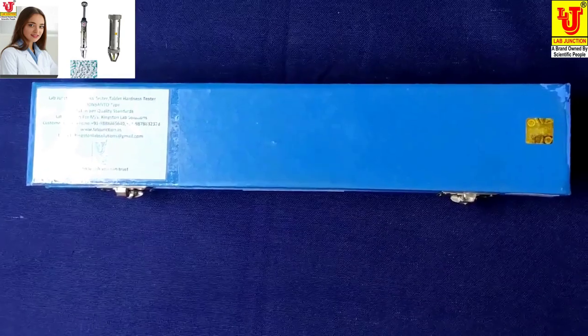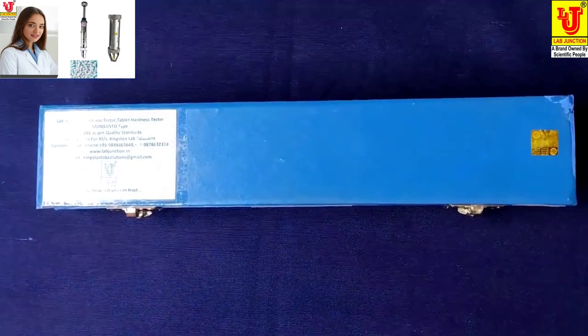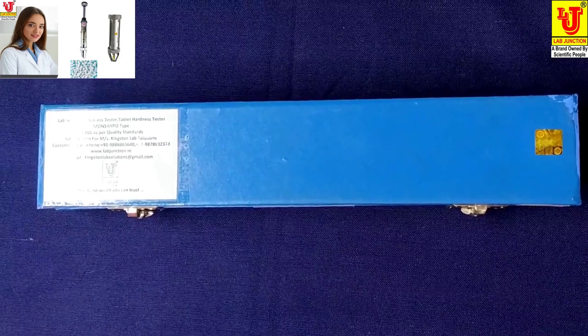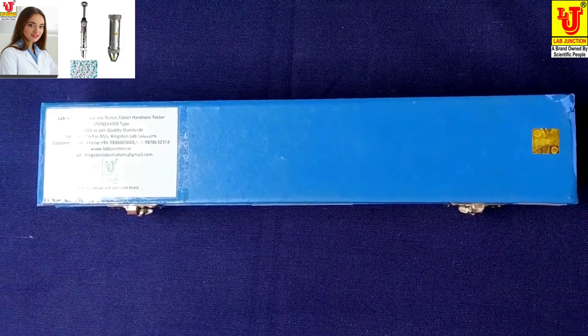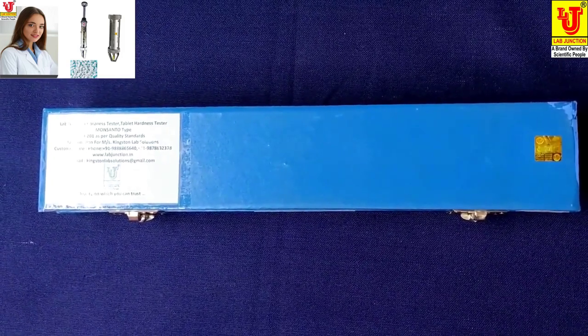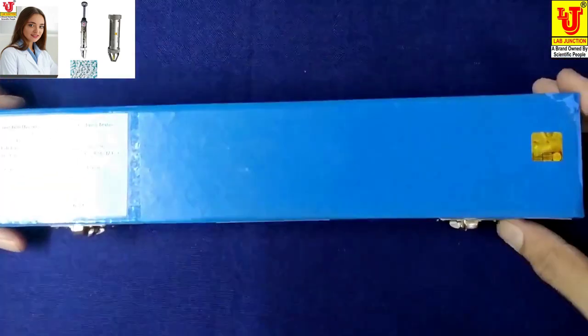Lab Junction. Tablet Harness Tester, Monsanto Type Model, LJ201. This is our instrument.